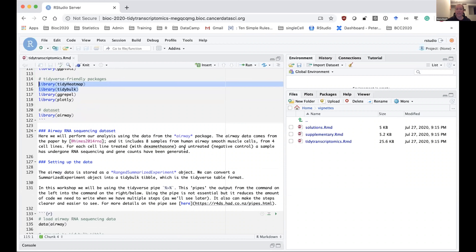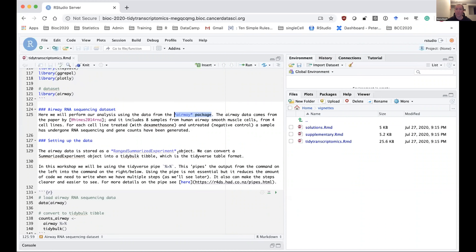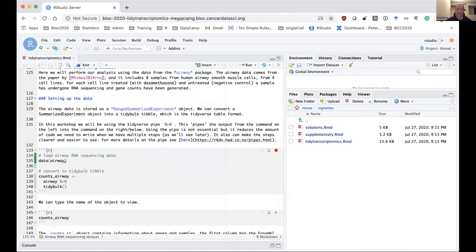The data we're using today comes from the airway Bioconductor package, which has eight RNA-seq samples from human airway smooth muscle cells. The eight samples come from four cell lines — each one has a treated sample and an untreated sample with dexamethasone. We're going to perform differential expression of the treated versus untreated samples. After loading the airway data, the first thing we do is convert it into a tibble — a tidyverse table format — using tidybulk, which creates the table and adds some descriptions for tidybulk to use.